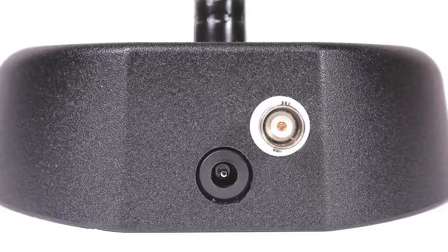We first added this for a researcher who wanted precise control of illumination times for a photoactivation experiment. The light base looks the same, but we added a BNC connector on the back.